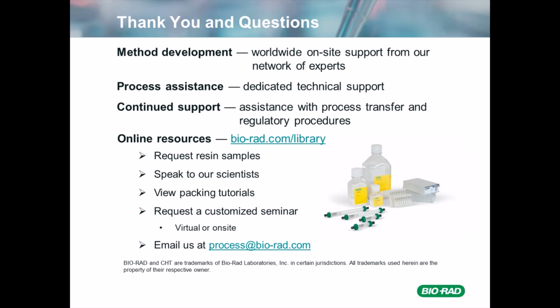And if it passes, you're done. Maybe the bed's a little taller than you thought it was going to be. If not, lower the head by a half centimeter or so and retest, and you keep doing that until you get within range. That actually worked very well for us at the 1.8 meter scale. And if anybody wants more information, contact me directly. I'd be happy to go over it in more detail.